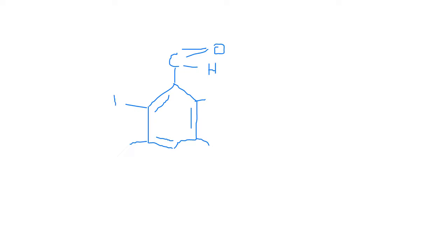Okay, let's say you have this benzene ring here. Under normal conditions, when there are no substitutions, you have 1 hydrogen on each carbon, so that gives you 6 carbons and 6 hydrogens. If you have a substituent of, let's say, aldehyde here, and there is a hydrogen here, aldehyde is the electron withdrawing group, right? And then you have 2 identical, so you have 4 hydrogens left. So this hydrogen here is identical to the hydrogen on the right side. So if I call this one A, this would also be A, right? That would also be A.